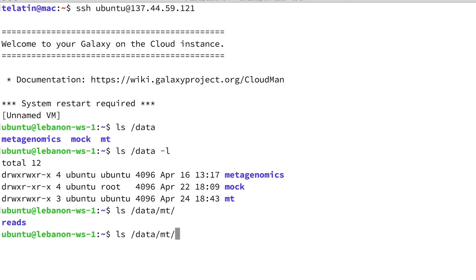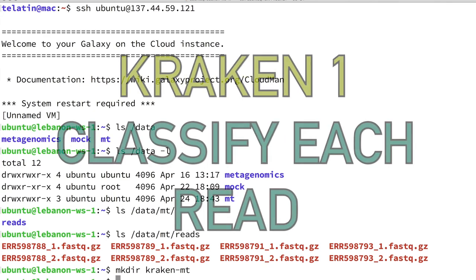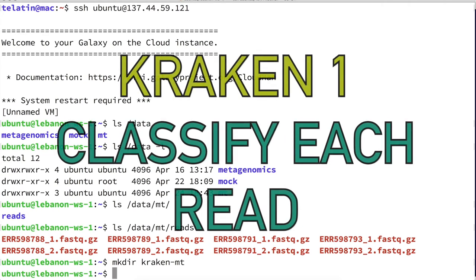There is a subdirectory called reads. Here we have four samples from the study mentioned by Mark's group, and thus eight files, since we have paired-end reads. Now we can start classifying one of these. I can create a directory called kraken-mt to store our outputs.